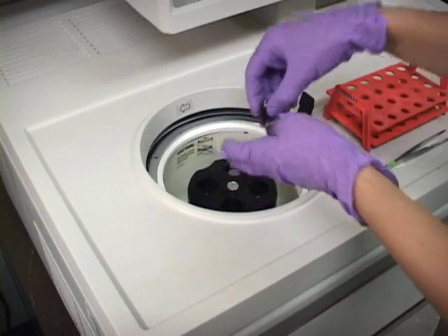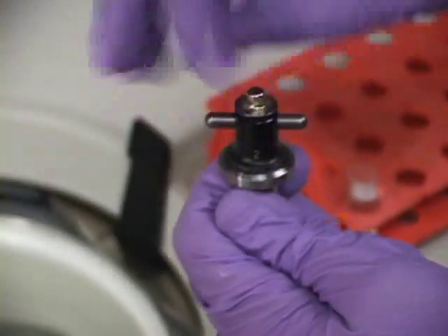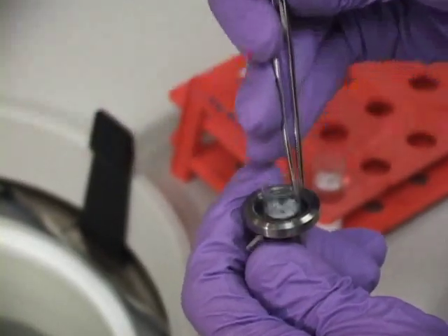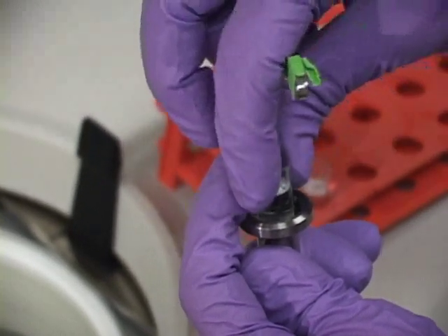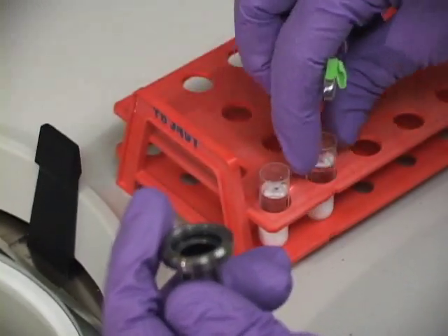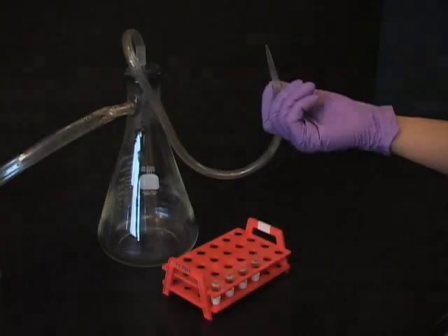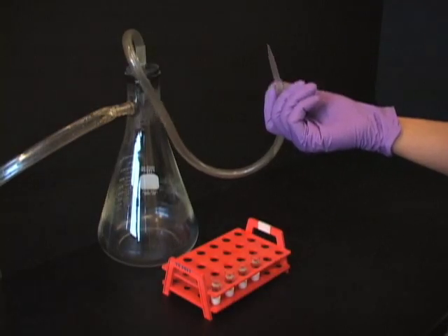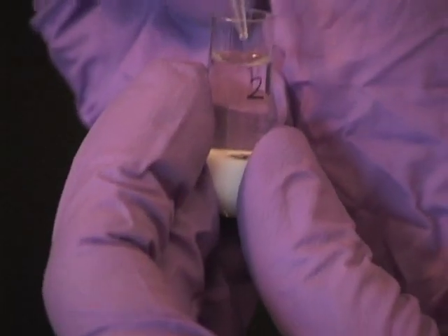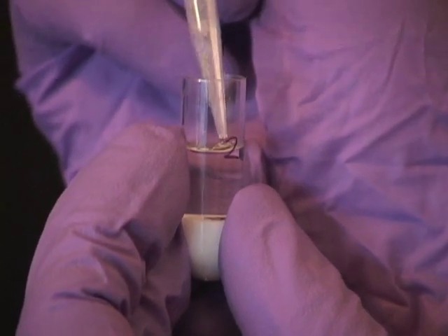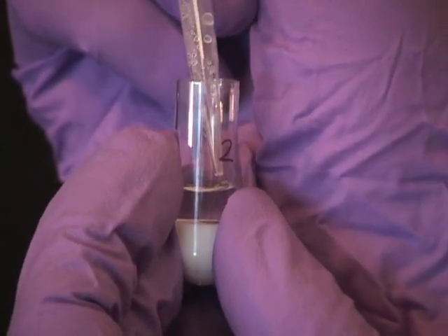After the spin, remove tubes with forceps. Carefully aspirate off the supernatant and the cushion. Do not allow the supernatant to contact the coverslip or background fluorescence will be high.